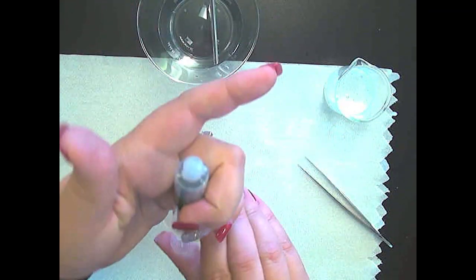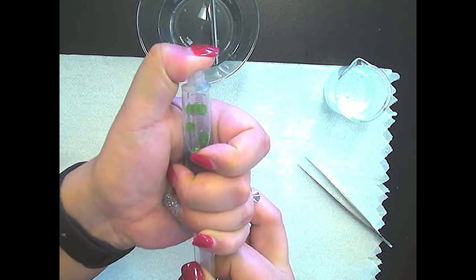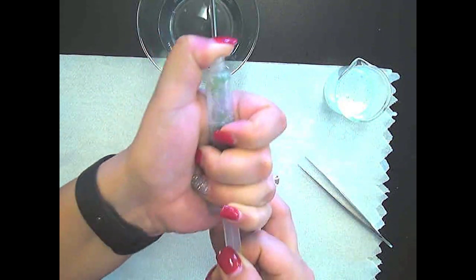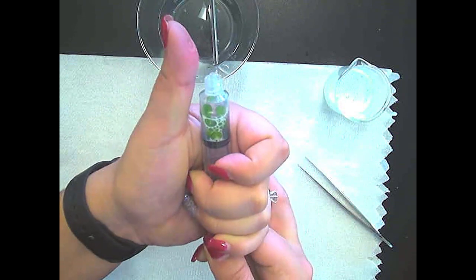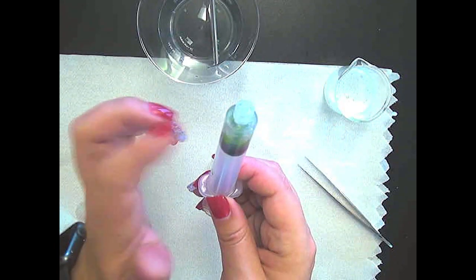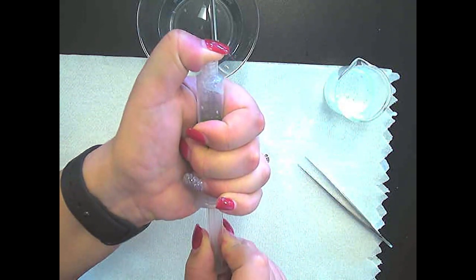So to remove the air, I'm going to bring the plunger and my water line up to the top as much as possible. I'm going to put my thumb over the edge of the syringe, pull the plunger back, and give this a little shake. This changes the volume inside the syringe, but doesn't actually change the amount of air or the liquid. That creates a vacuum, which is what we need to get these chads to sink. They may require a couple of tappings, and this process may require a few tries before you can get all the air out from those pockets.